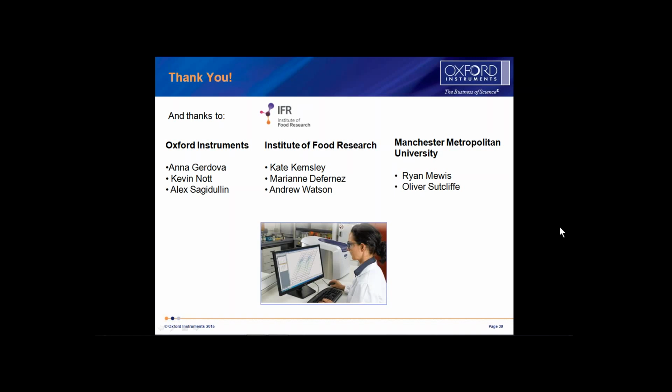There's a question from Marcus Wright, that at some time we may need to check the assignment in the hexanoic acid. Certainly, we can do that. Marcus also asks, do the samples spin? No, there's no spinning on the system. There's no need to spin.